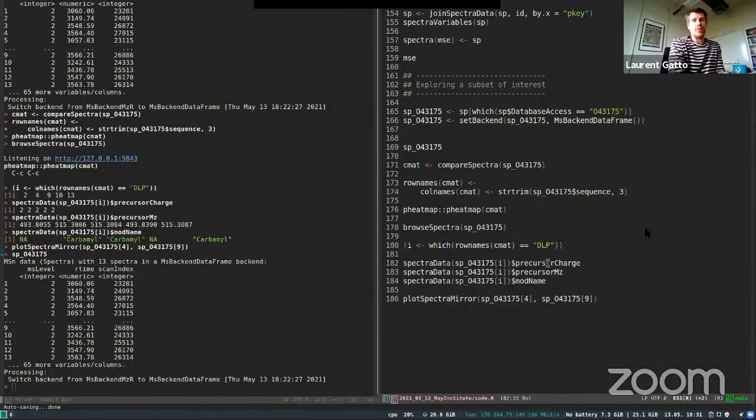There are cases where I start from the beginning, as I showed here, and there are cases where, for example, I get a spreadsheet with quantitative data that was produced by, I don't know, MaxQuant, Protein Discoverer, any piece of software. And then I would focus on the reproducible aspects later on. This really depends on your priorities, what is important for you, and also, of course, on the time you have. Can you invest time to go back to the raw data, or do you prefer to invest the time and your skills on the analysis of the quantitative data?